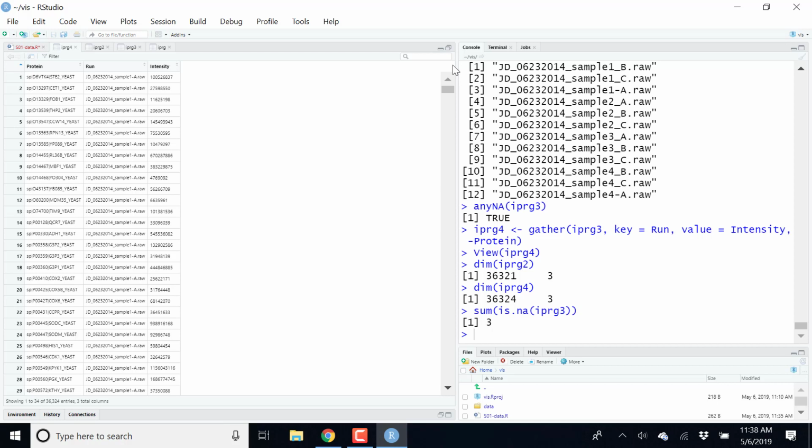With this representation, I can very quickly, for example, spot that I have missing values for sample C. Or if I had another missing value here, I could quickly spot that something is weird with my protein 3. That's the protein that seems to accumulate missing values. So again, this is something that we could, of course, compute with the long data frame. But I think it's interesting to realize that these different data sets have to.